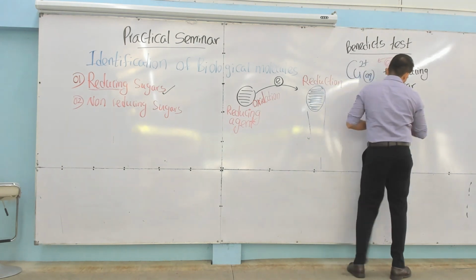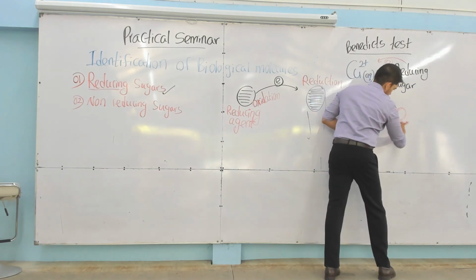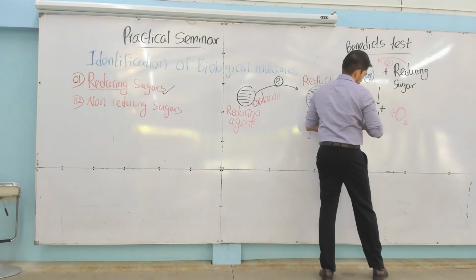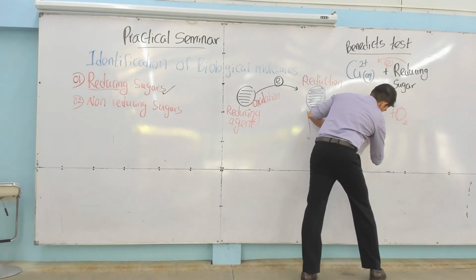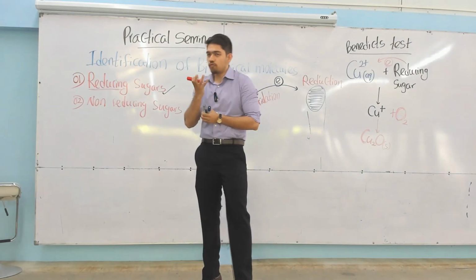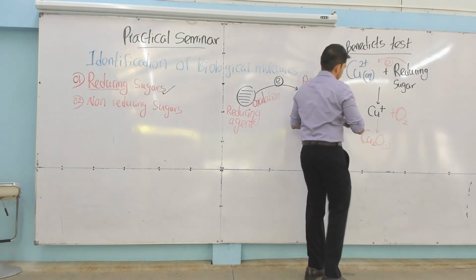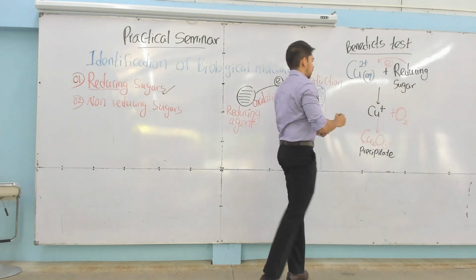What's going to happen is he is going to react with our atmospheric oxygen, O2. Okay, it's going to produce an oxide, Cu2O, cuprous oxide. Okay, this cuprous oxide is a solid. So when something solid forms in a solution, what do you call that? It settles down. What do you call that? A precipitate. It becomes a sort of sediment that is going to settle down in the solution. Okay.